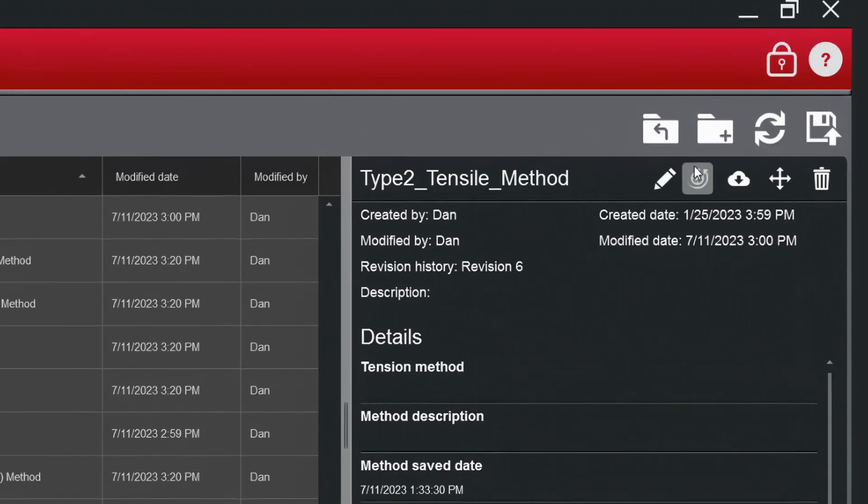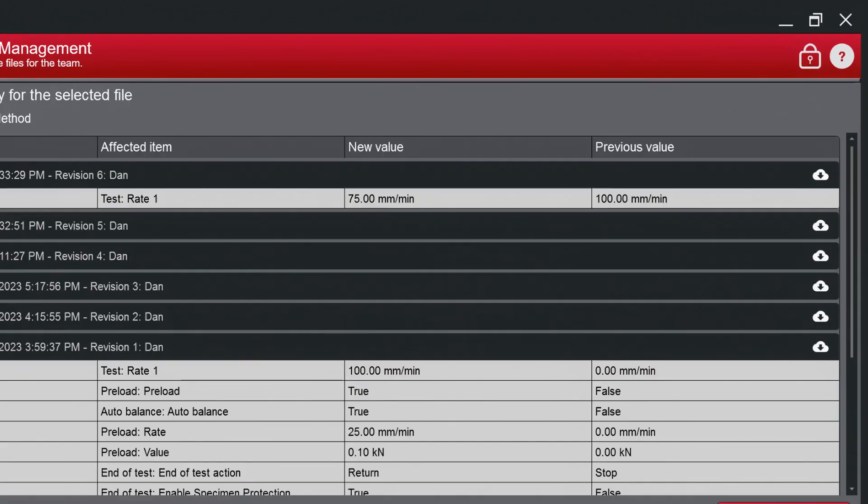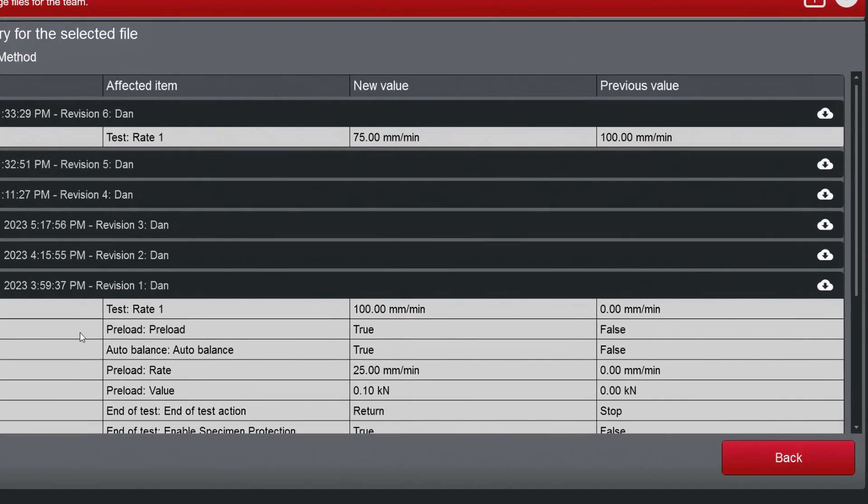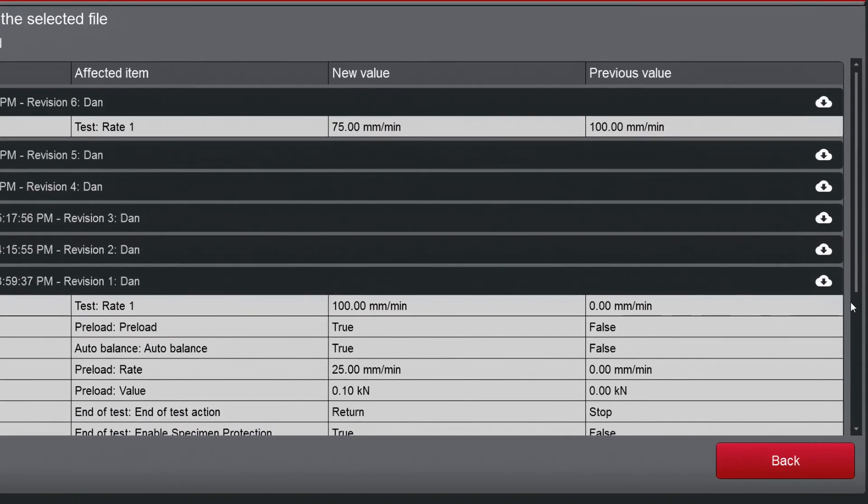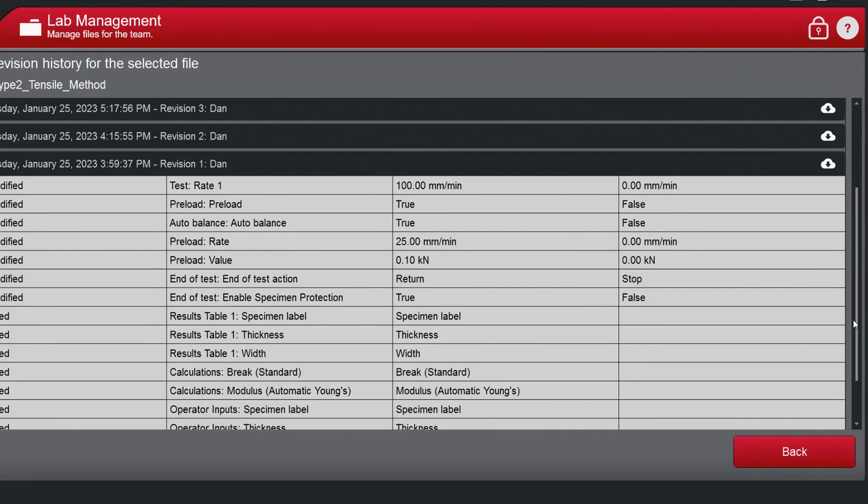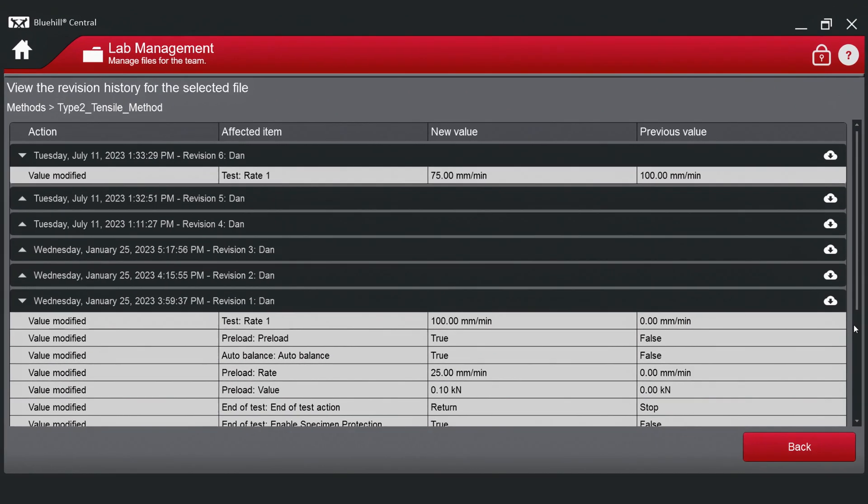Clicking the revision history icon will display the detailed change log for the selected file. This history lists all revisions and the detailed changes associated with each revision, back to when the file was created.